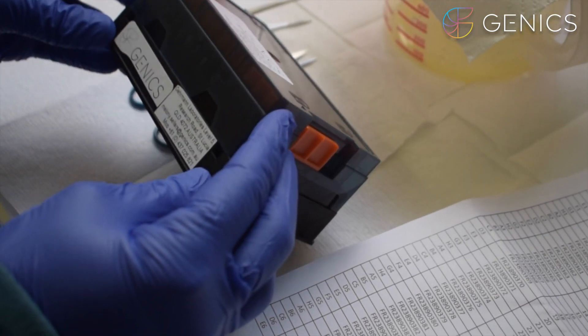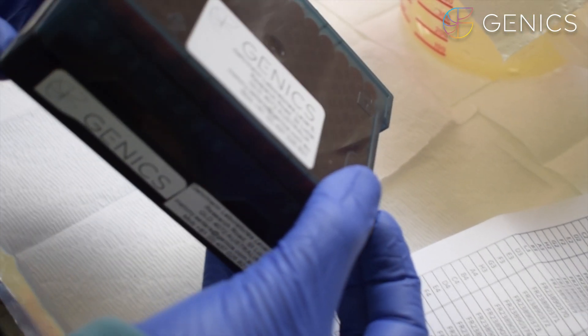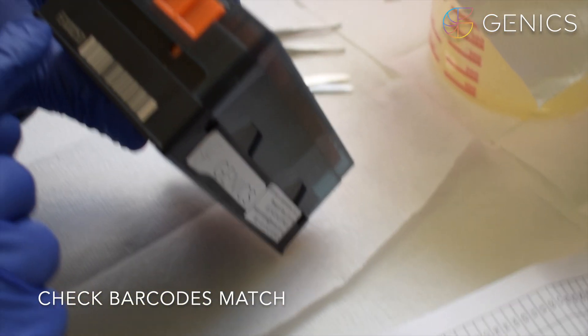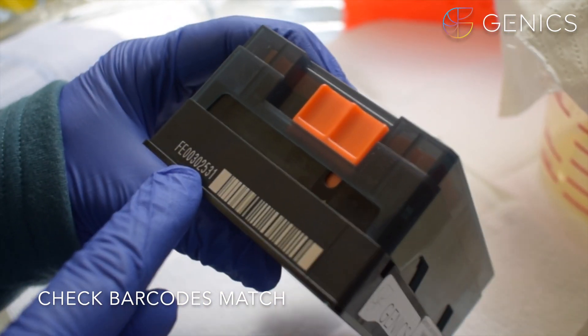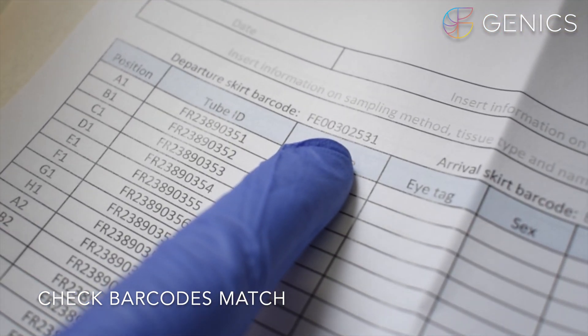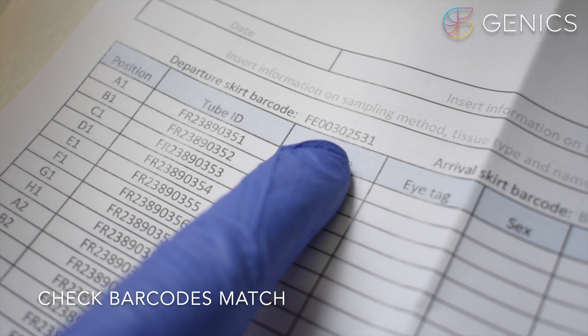On this box our skirt barcode which is on the end here is FE00302531 and this barcode needs to match your data sheet in this position here.